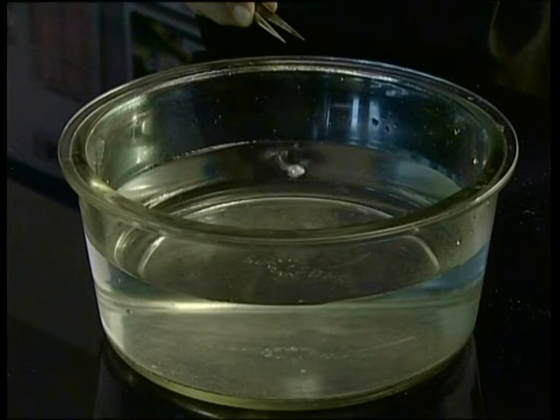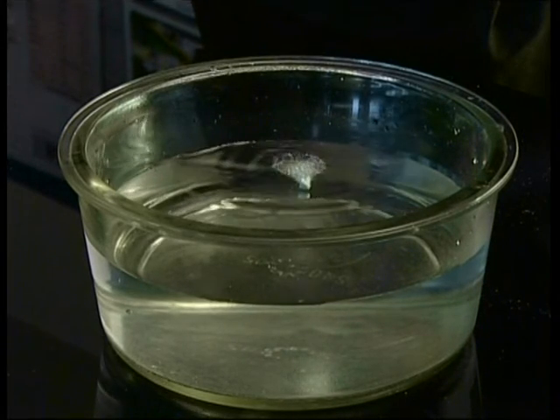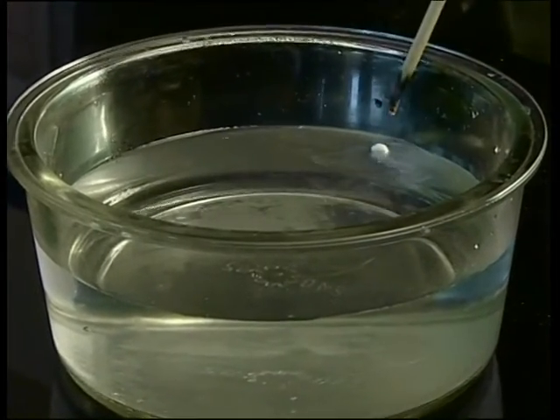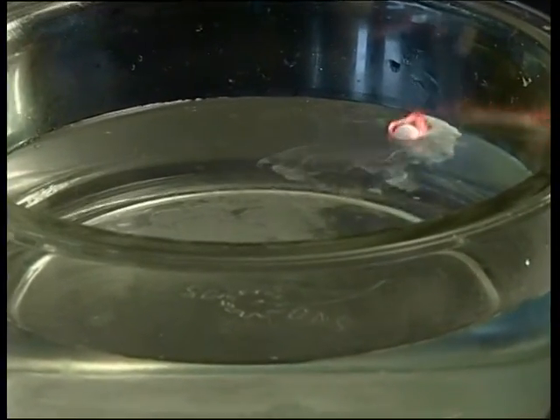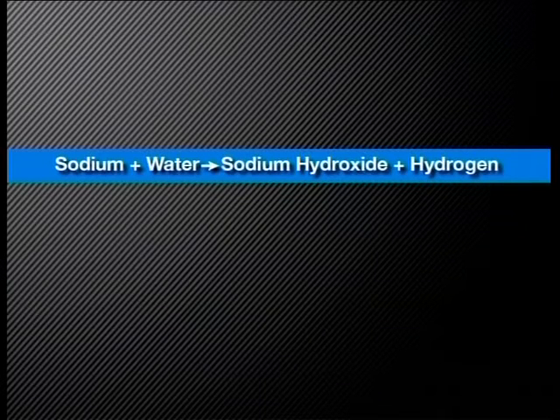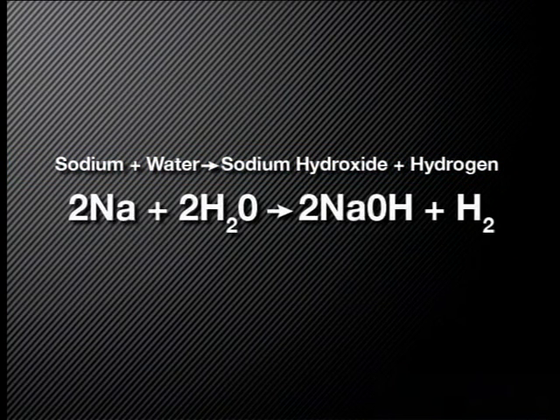Next, we will look as this experiment is repeated with sodium. When a piece of sodium is placed in a trough of water at room temperature, you will observe that the sodium moves along the surface of the water quite quickly and melts into a little silver sphere. A gas given up from the sodium produces a popping sound as soon as a burning splint is brought near the metal in the water. When a piece of red litmus is dipped into the water it turns blue, indicating that a basic solution has formed. We conclude that two products were formed: sodium hydroxide and hydrogen. The formula equation is: Na + H₂O → NaOH + H₂.